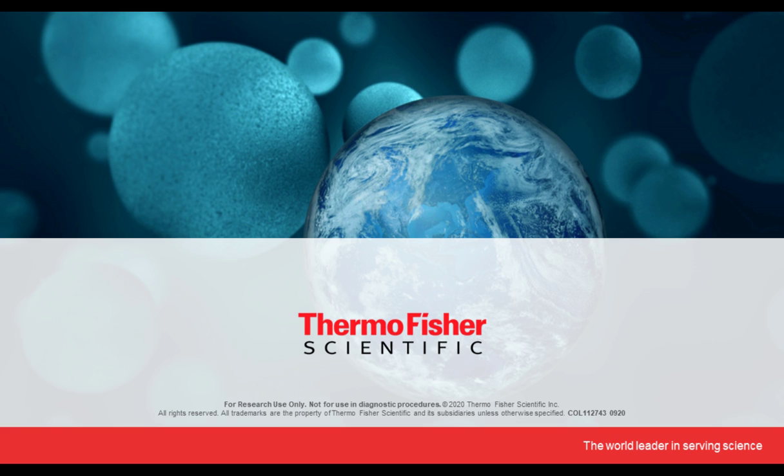Thank you. Now, how are the signals of protein bands measured with the no-stain gels? Great question. I think I answered this earlier on. In this set of experiments, we are using the iBright Imager and the analysis software that comes with the iBright Imager for quantitating the signal from no-stain reagents.